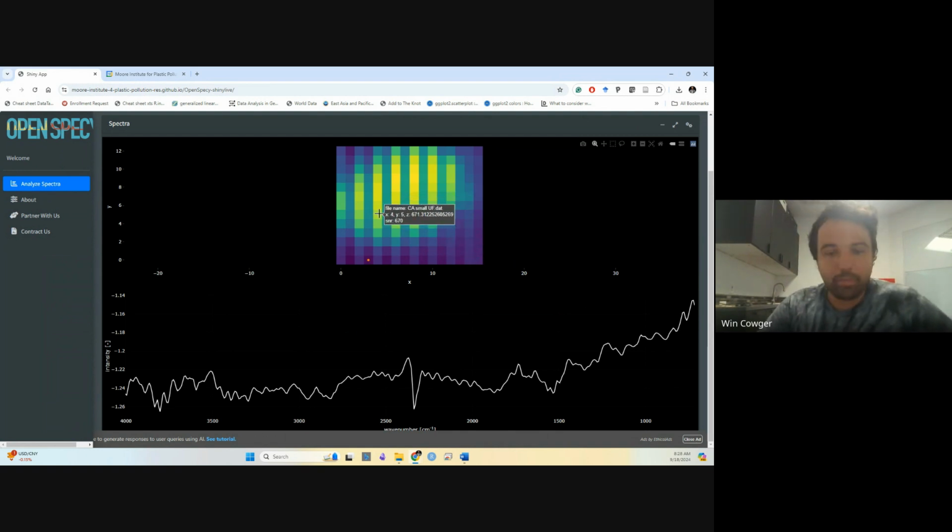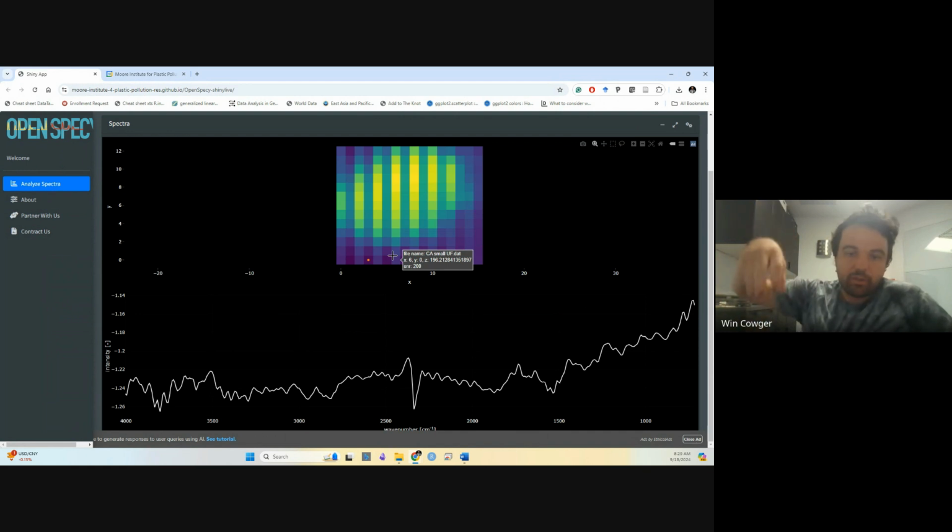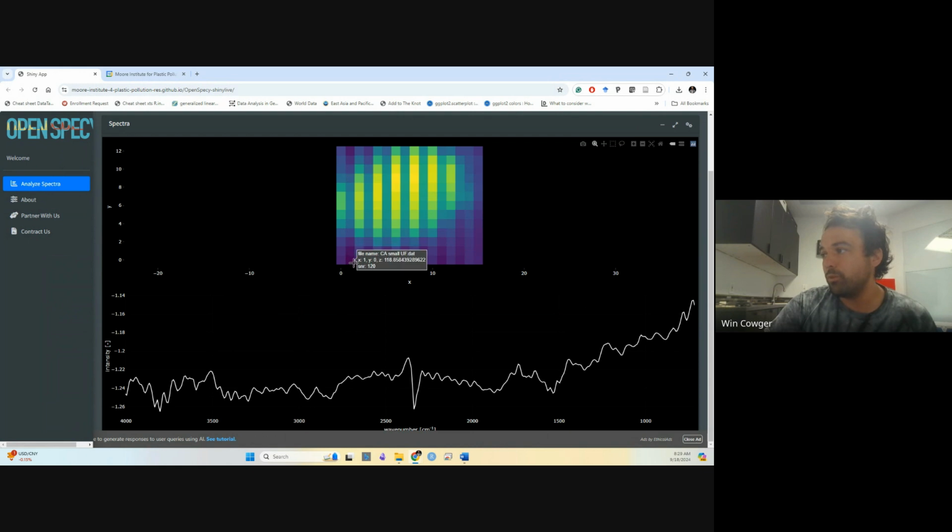So basically what's happening is when you're collecting these hyperspectral images, you first collect a background. In our case, we're going to find a spot on the stainless steel mesh where there's no particles. We collect a background there. It's just atmospheric information, right? There's no sample. We just have a reflective surface and atmospheric information. Now, when we're over the particles, we've subtracted that background, so you get this weird artifact where there's negative values sometimes.